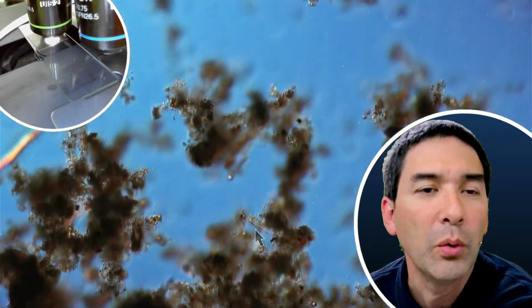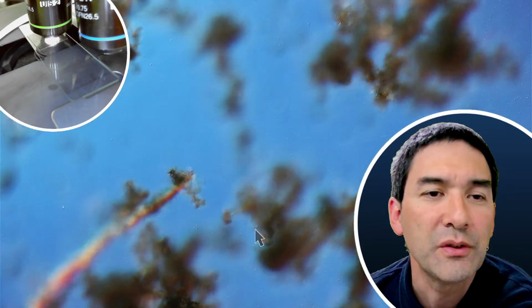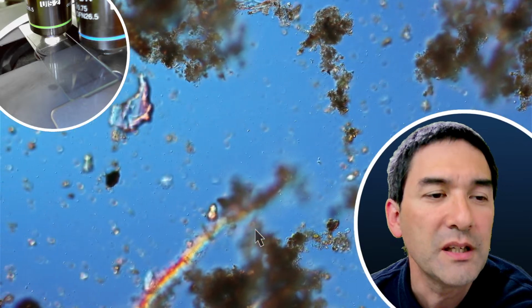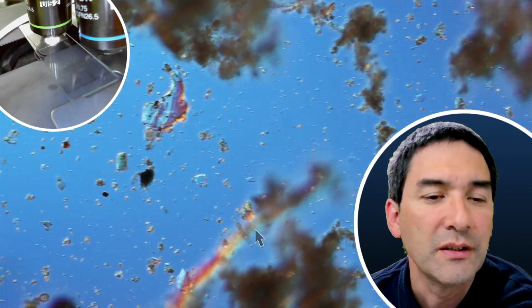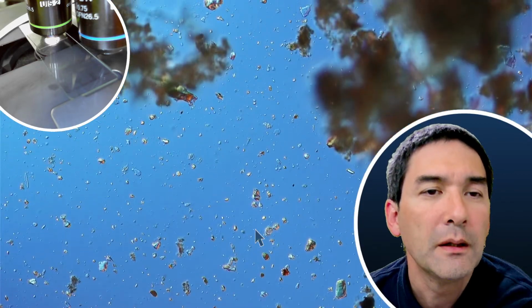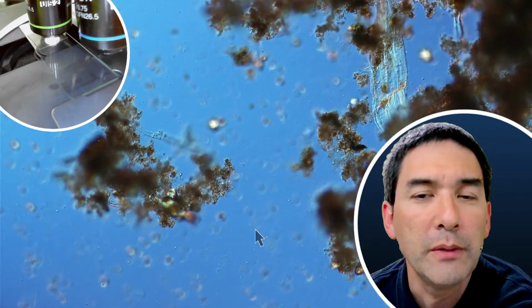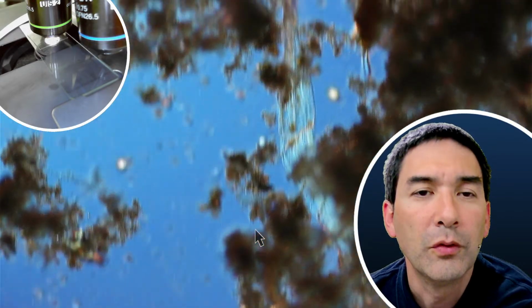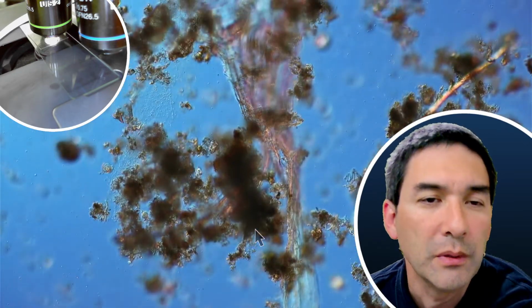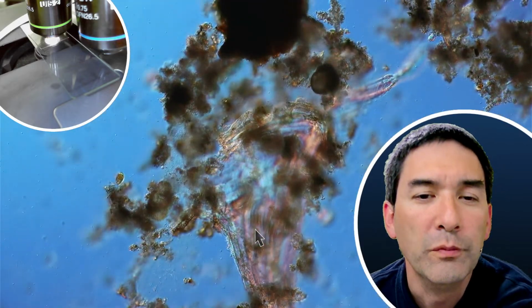You can occasionally do a similar thing also with house dust, because house dust can be quite interesting. I've seen some interesting structures already, some unexpected structures also in house dust. Lots of smaller debris. Something that did surprise me a little bit is that the sample has been on my table for over 2 weeks. I did expect some microorganisms to reproduce, and basically I did expect more movement.